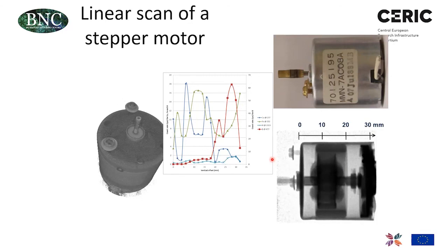The real merit of the PGAA NT technique, the combination of imaging with element analysis, is that we can better explain our results based on the joint interpretation of these two data sets. Element analysis alone and imaging alone would not be as informative as the merger of the two data sets. This is illustrated in an example of a stepper motor.